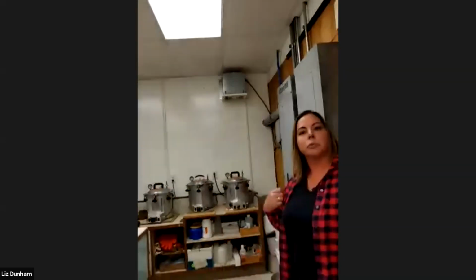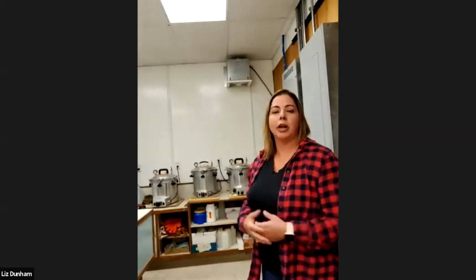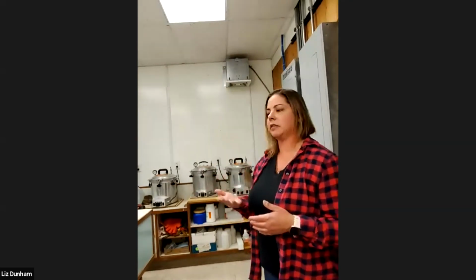So that was sterile conditioned under the hood. It's a laminar flow hood. We use individual hoods because the employees really like them, and we're not big enough to run big baker hoods. It keeps the hot air from going on your face. You can see the plexi in front of her. Everybody gets their own station.